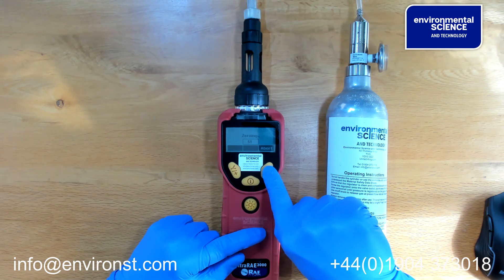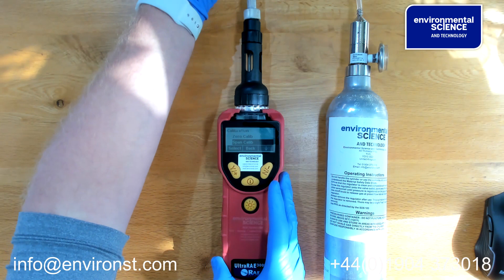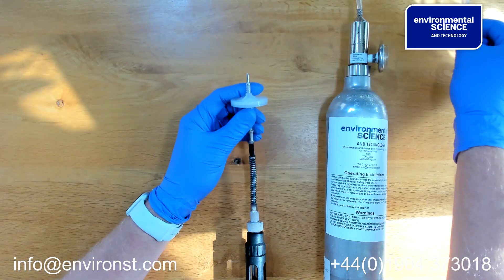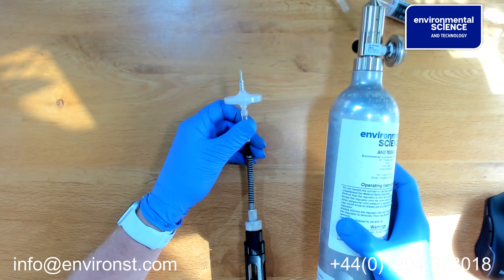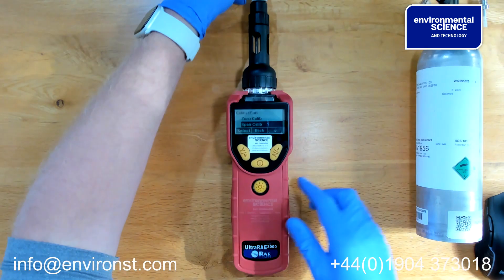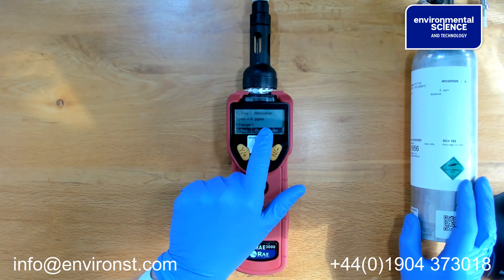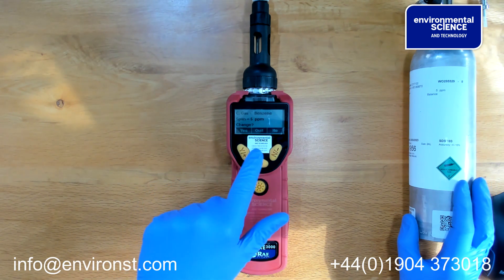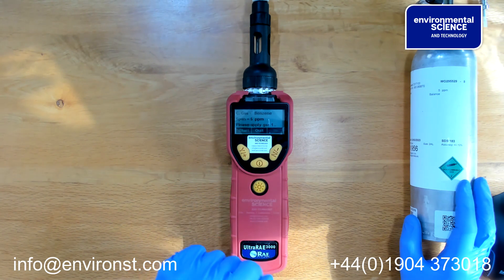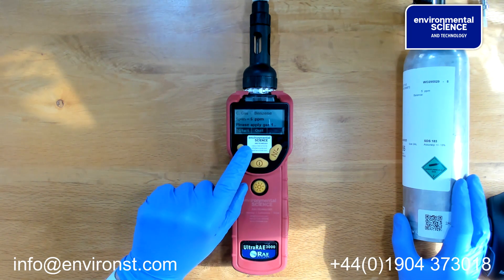We then remove the zeroing filter and take our calibration gas, which is 5 ppm. We enter the span calibration menu. It asks: calibration gas is benzene, span is 5 ppm — do you want to change it? No, because that's our gas. It then says: apply the calibration gas now.